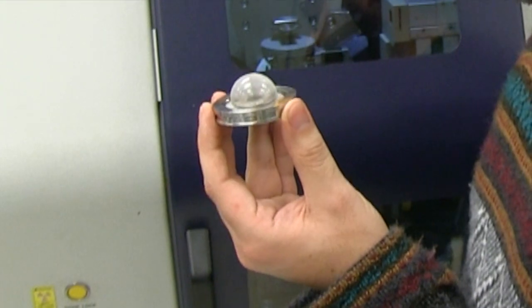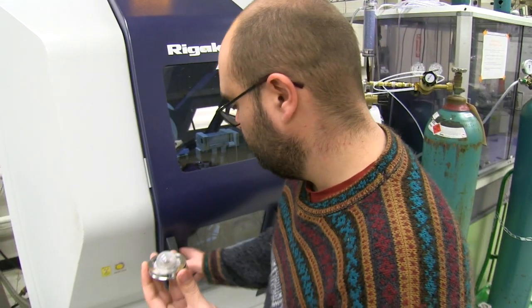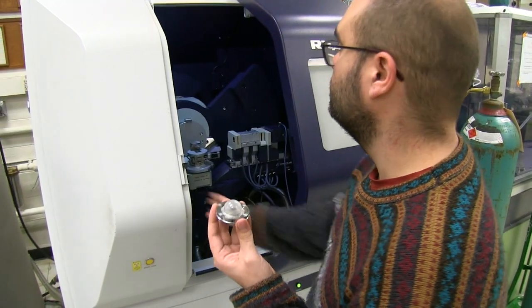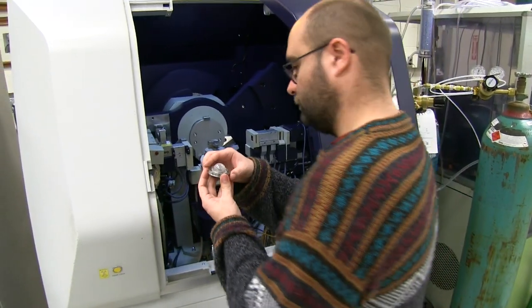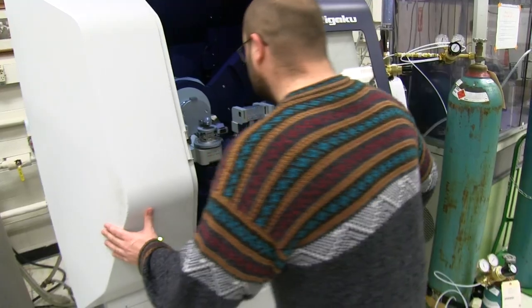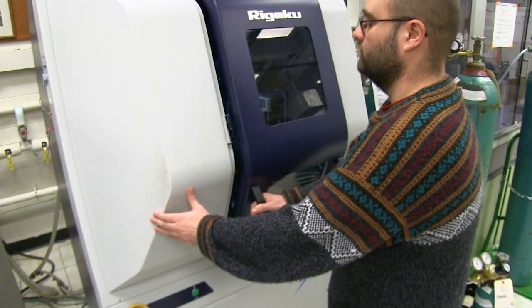In the sample holder, which is sealed, we can perform the X-ray measurements without degradation of the film. X-ray characterization is really very basic to understand the relation between the electrical properties of the systems with the crystalline structure and the microstructure.